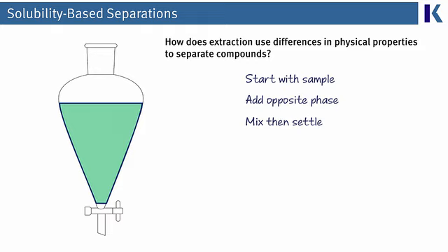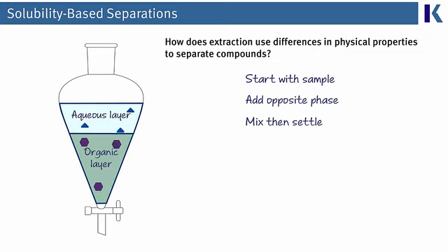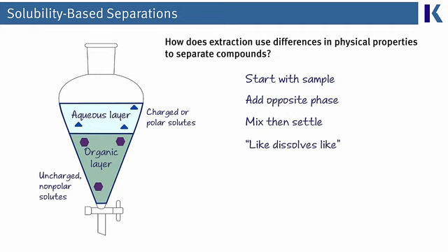On one hand, the component has a greater affinity for the opposite phase compared to the original sample phase, where we have charged or polar solutes that are going to be pulled into the aqueous layer. On the other hand, the other components remain uncharged and nonpolar, and so have a greater affinity for, and thus remain in, the sample phase. This principle can be more easily remembered with the mnemonic "like dissolves like."